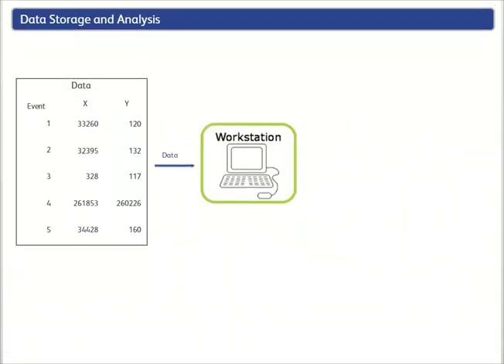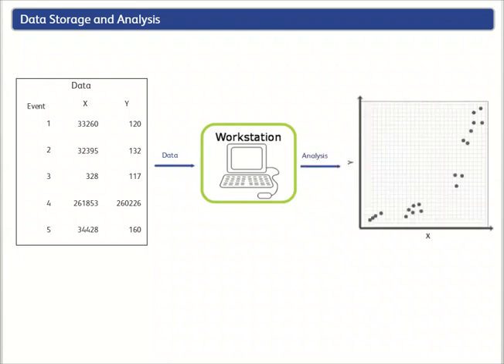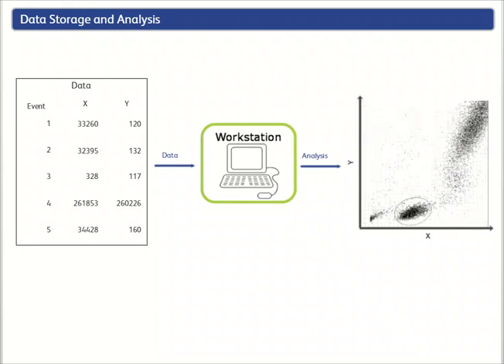Data is received and stored by the host computer. The computer enables statistical analysis and graphical display of data. The computer workstation stores and displays data for further analysis in the form of CSV and FCS files.